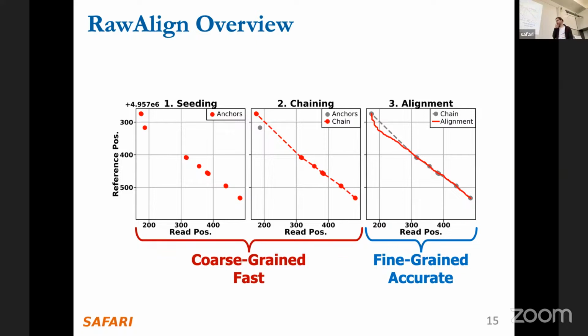Okay, so how you actually run these sequencers is that you take a biological sample from somewhere, you add some chemistry, you put it into a centrifuge, so you really extract the DNA molecules. During that process, you have what we call library preparation protocols.